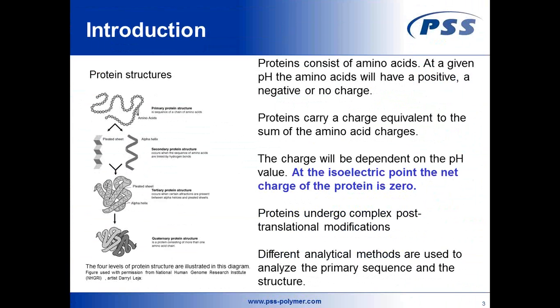And last but not least, and this makes it even more difficult, these amino acids can have charges. So we deal with proteins that are either negatively or positively charged, depending basically on their so-called isoelectric point. When you have found this isoelectric point for a protein, you can measure it at an overall charge sum of 0. This is the point you should look for in protein analysis when you do SEC measurements, because then you will get rid of most of the possible interactions.